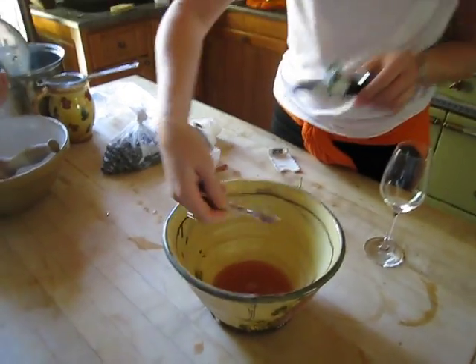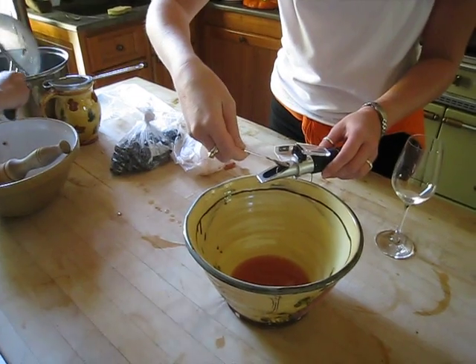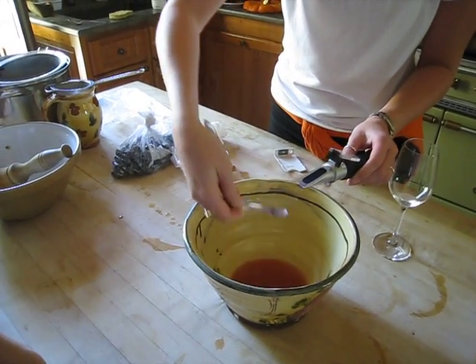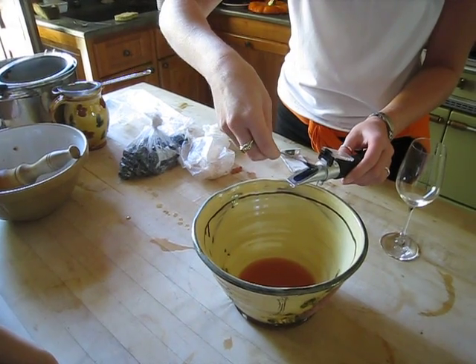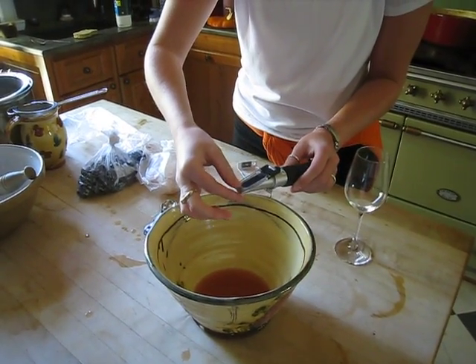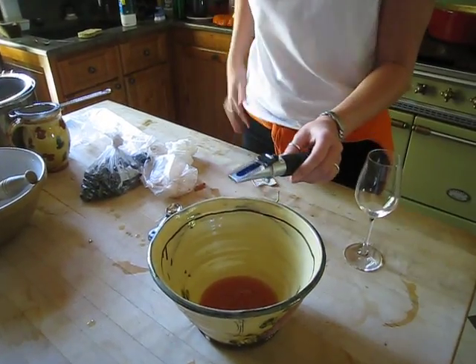We're going to check and see how much sugar is in these babies — see how far away they are. She puts it on the lens, flips it shut, and then we move it outside so we can see through the light.